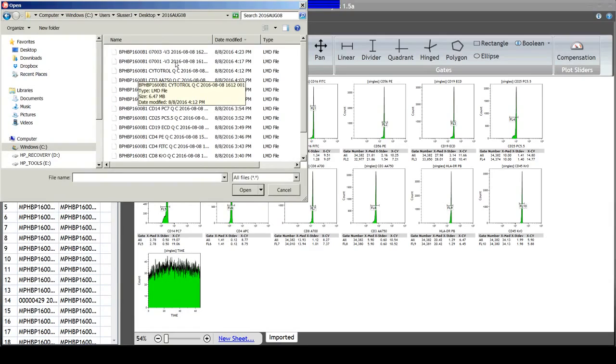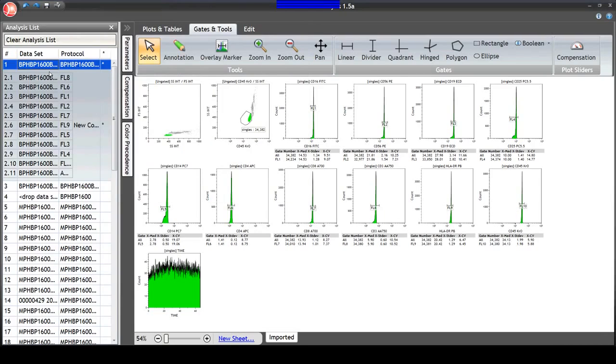So my first set of data are going to be quality control samples for my flow cytometer. And the first of those is the flow set bead. This is a bead of defined fluorescence for me, and I have selected channels in my dot plots that I target my beads to, and these targets allow me to optimize my voltages on my PMTs in order to see negative populations and positive populations fully contained on my 4-log scale down here, and always have my data in the same place.